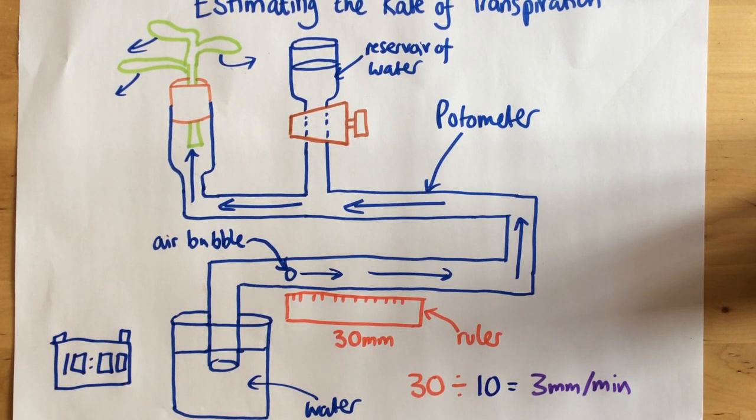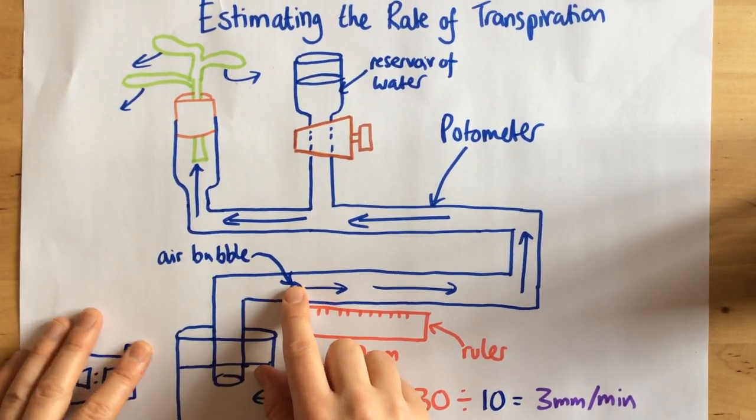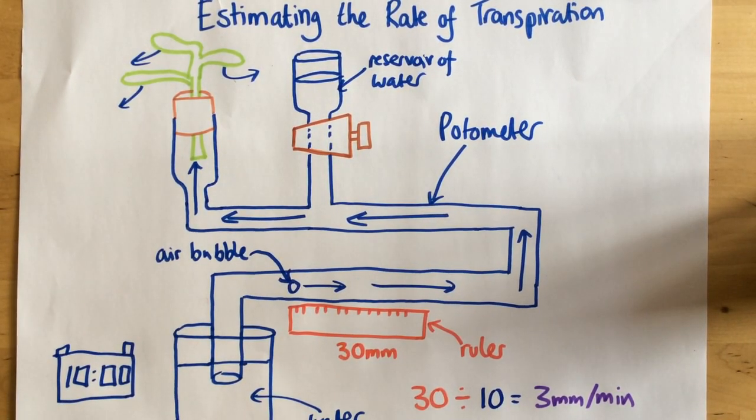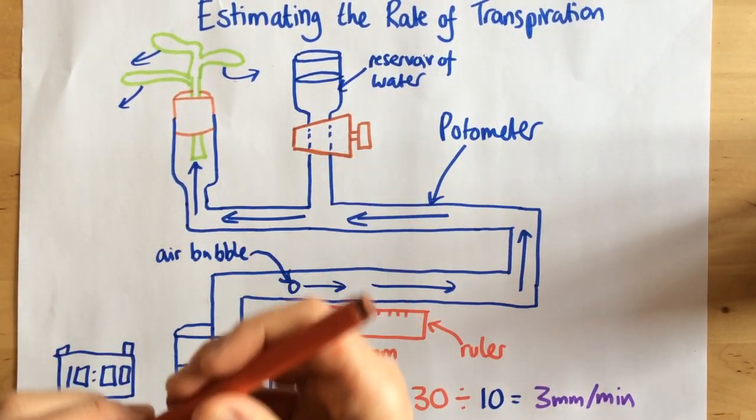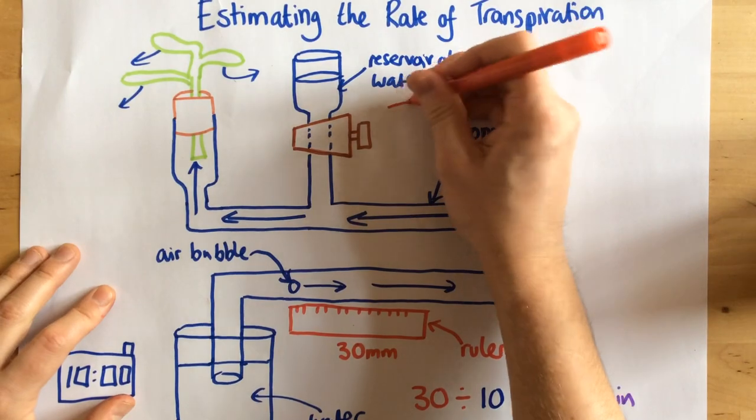So, what I need to do, after I've done the experiment once, so I've allowed the bubble to move once, this is where this reservoir of water and this little tap comes into play. So right here we have a tap.